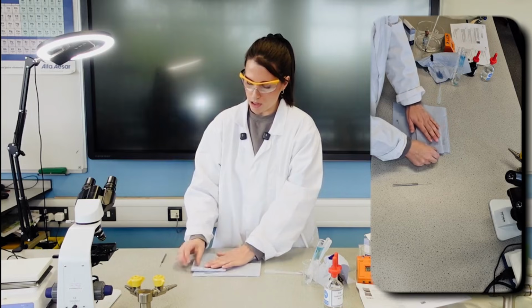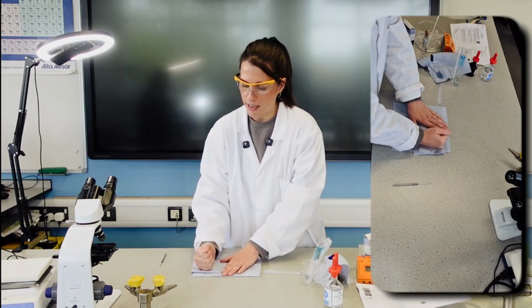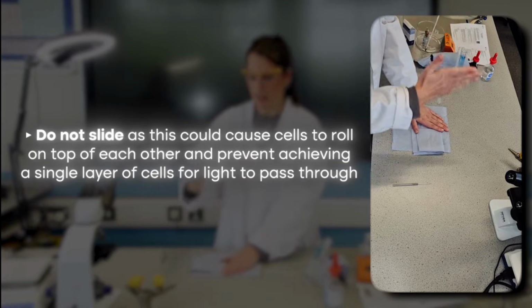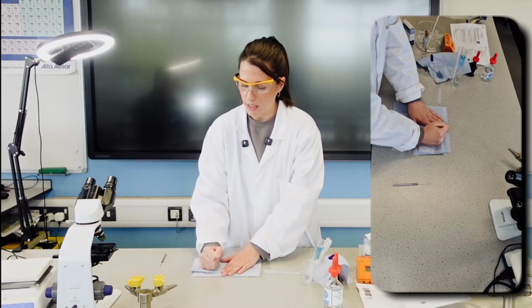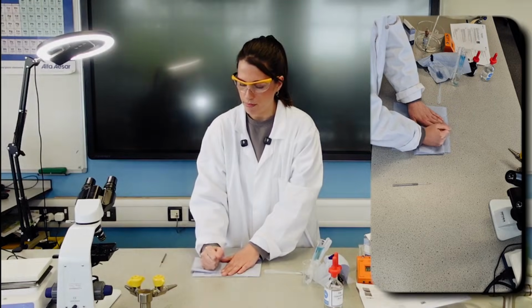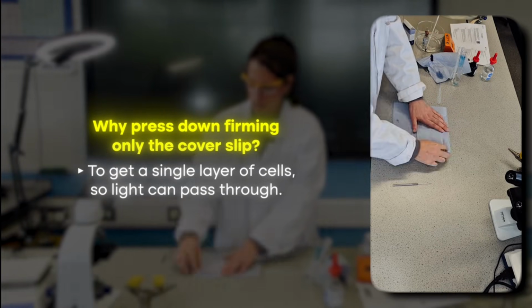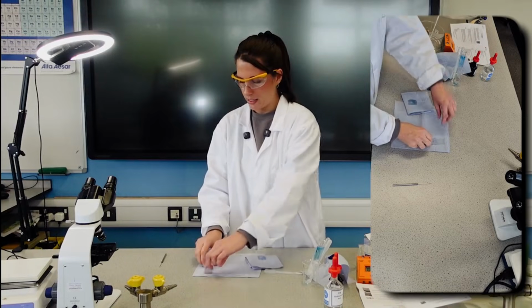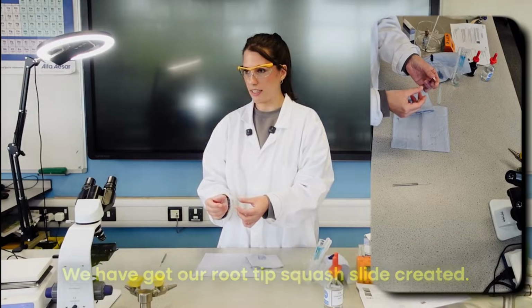So I'm going to place this on top, so it's also going to absorb any liquid either side, and just smooth my hand, not sliding it because we don't want to slide it. I'm keeping it in one position, but just going back and forth. So it's going to gently squash it. And now we can see that we have got our root tip squash slide created.